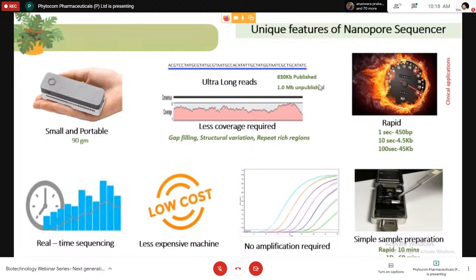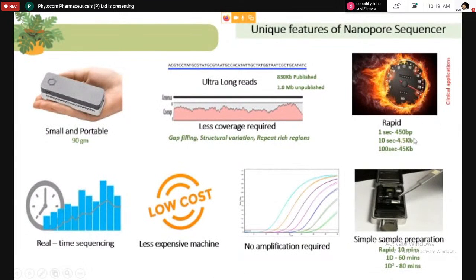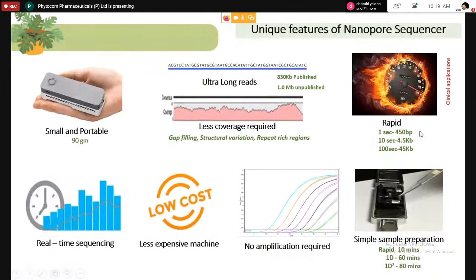And suppose you do Sanger's method for reading the sequence, after doing the sequencing PCR and loading into the machine, it takes almost 2 hours to do the capillary electrophoresis. Then it will take the reading. But here, base calling is done per second. 450 base pairs are passed through the pores. So for that, the current is generated.